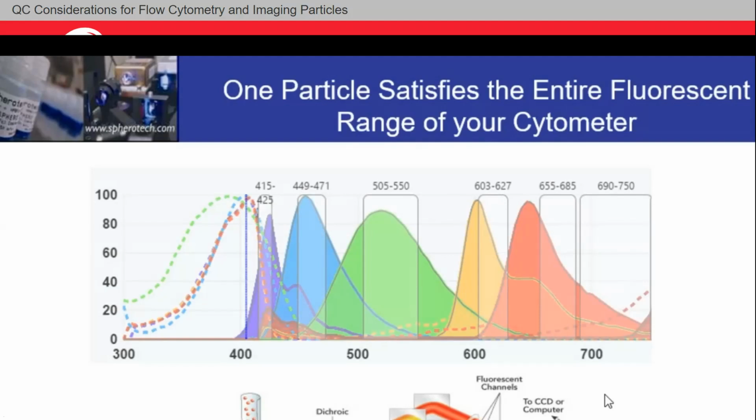You're going to have multiple lasers going through multiple bandpass filters or dichroic mirrors, reflecting through your interrogation of this microfluidics channel. So you're going to have your particles or cells going down this microfluidics channel, being interrogated or excited, and each one of these pieces of information will come off of these mirrors. They'll have bandpass filters and mirrors that will then lead to, quite often, photomultiplier tubes, avalanche photodiodes. Sometimes you'll see silicon photodiodes. It's becoming more robust and it may change, so most often we just say capture parameters or tools.